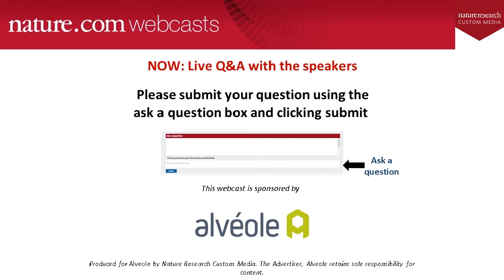Our next question asks, you mentioned that maskless photopatterning is compatible with different cell types, but how compatible is it with EM grids made of different materials? Yeah, so in this talk we touched on works that use different kinds of grids than we use. I'll just remind the audience, we've been using these holey carbon films on gold.